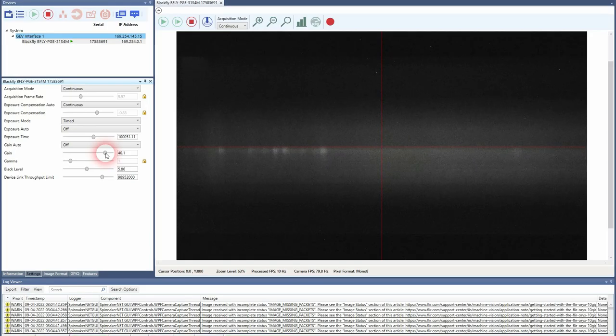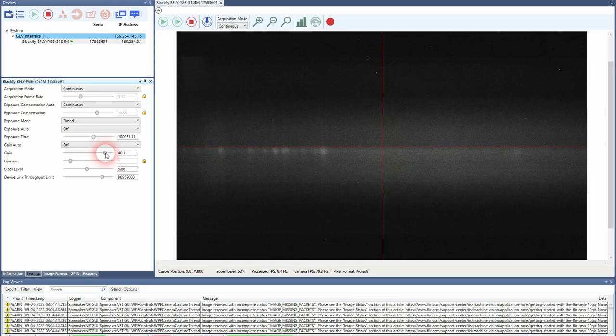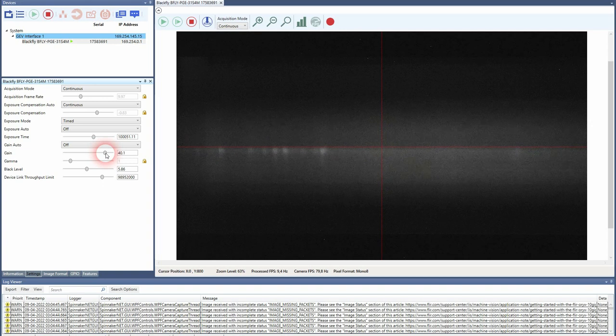So this is normally aligned. So we can switch off the spin view software.